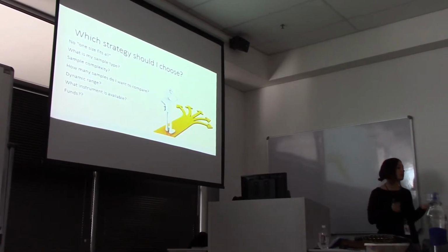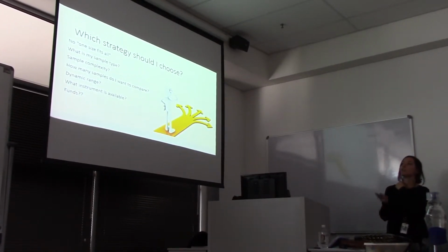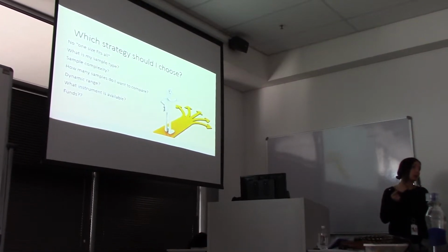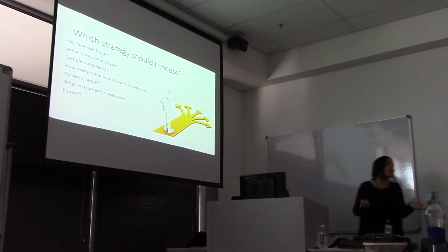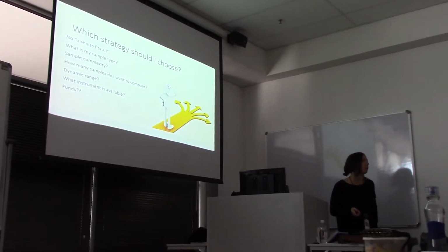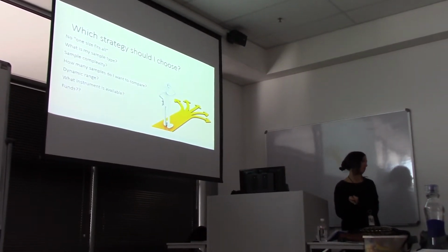How complex is my sample? That's important. You might be limited if you've got a very highly complex sample. There are different strategies you need to employ. How many samples do I want to compare? That's what we've talked about. If you've only got 4, go for a 4-plex.